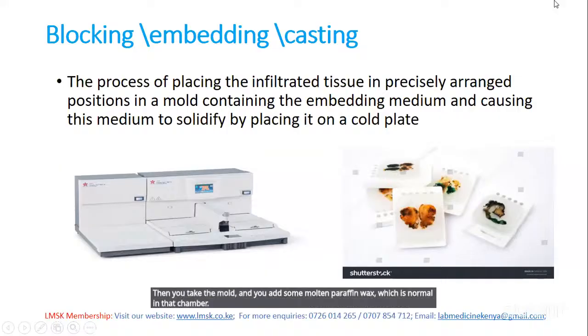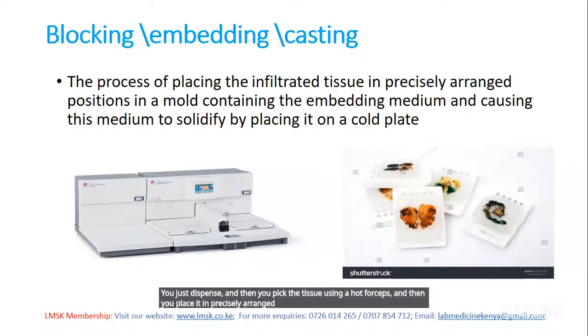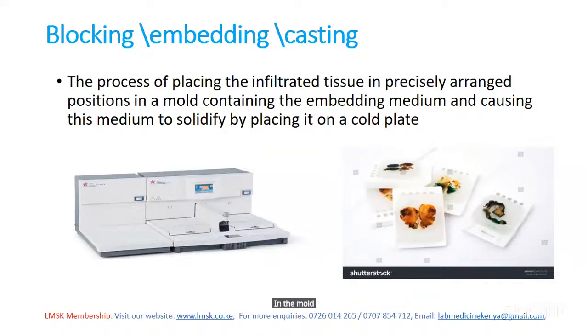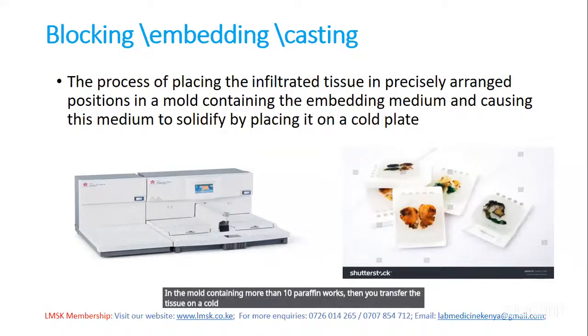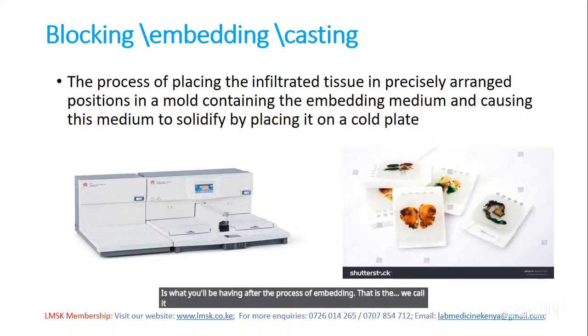You just dispense, and then you pick the tissue using a hot forceps, and then you place it in a precisely arranged position in the mold containing molten paraffin wax. Then you transfer the tissue onto a cold plate. You allow it to cool for some time, and after cooling, you will be able to detach the mold. And what you're seeing on your right is what you'll have after the process of embedding. We call it a paraffin wax embedded tissue block, PETB.